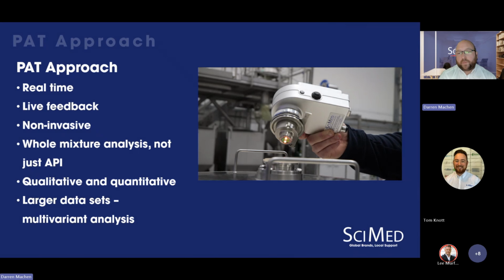One area that I wanted to talk about, because it's very important, is that depending on what you do, you may have a process after making animal feeds, using NIR, in this case a process version of NIR, to allow you to monitor your process within your production. PAT, or process analytical technology, is becoming very important for real-time results.